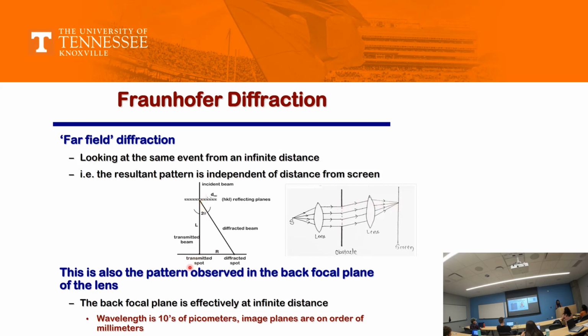Now, this is the diagram that we discussed, right? How can we calculate using your L and R, where L is a constant in a microscope. R would be shown to you in the diffraction spots, and from it you can calculate d, right? So that is what they call far field diffraction.